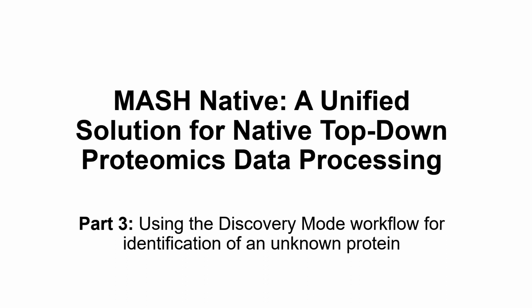My name is Melissa Pergandy and I am a postdoctoral associate in the Ying-Ga Research Group at the University of Wisconsin-Madison. In the following video tutorial, I will be introducing you to MASH Native's Discovery Mode workflow. It is important to note that this video tutorial is intended to be used in parallel with the step-by-step instructions found in the Getting Started guide, which can be found in the Documents folder in your MASH Native download package.